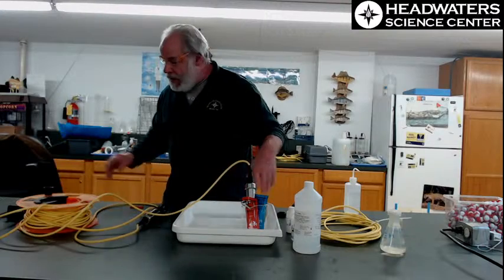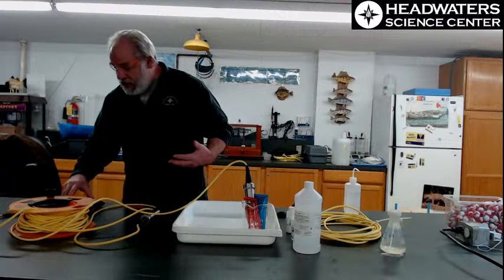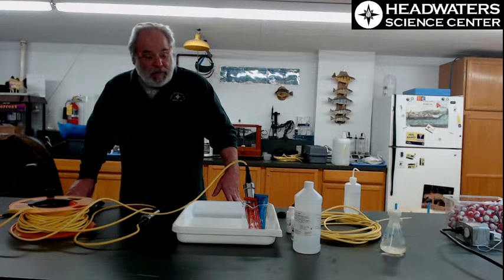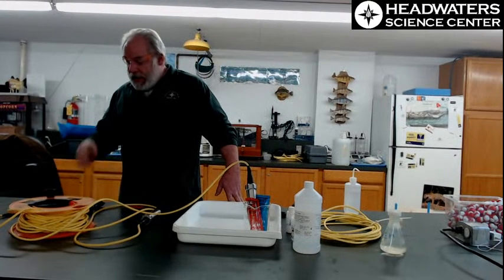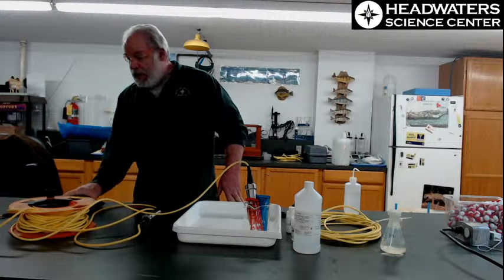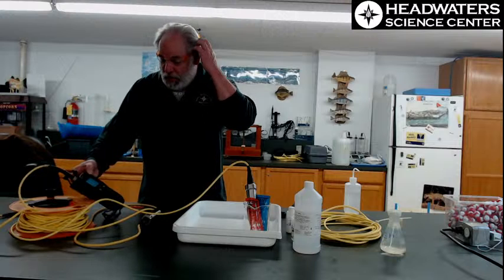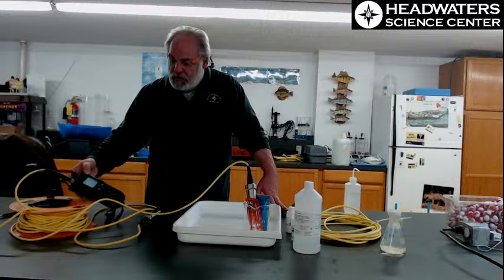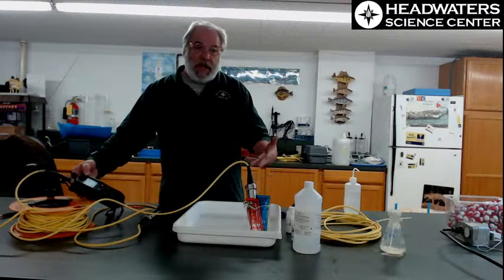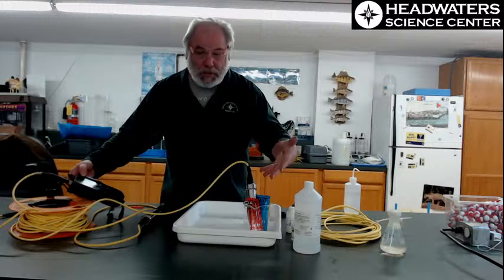And the first thing I do, and this helps me decide whether the last time I was out I had some good readings, is I read it. I get the measurement of a solution that's 4.01. My meter says it hasn't stabilized yet. These meters are pretty fast, and it's measuring out to 4.05, which tells me that's the first measurement from the last time out, that I was pretty close the whole time I was out last time.